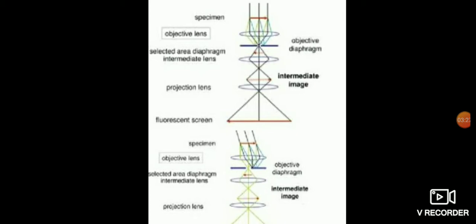This mode is obtained by intentionally excluding all diffracted beams and only allowing the central beam to pass through the specimen. This method is quite useful to study the microstructures of the samples in a plane view and the number of layers from a cross-sectional view. The plane view images help in understanding the formation of the interior microstructure and determining the average size of the particles.